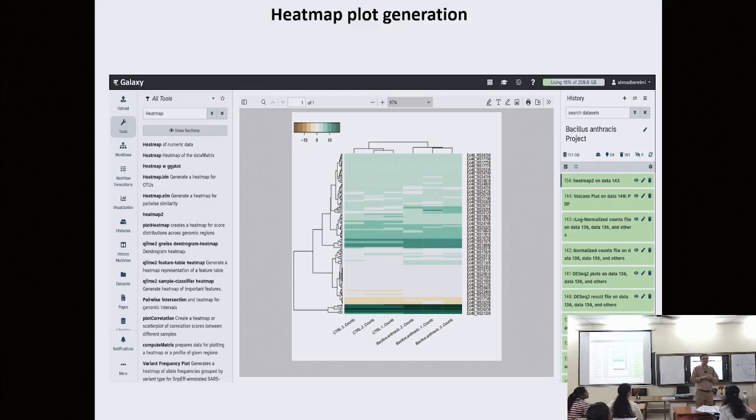Okay. So you will make a gene network, and then you will decompose the network into groups of genes or modules of genes, and those modules could be representing a single pathway or many pathways that are cross-talking. Okay, they may be represented in those modules. And because genes in those modules are connected under many different conditions, it means that these genes are regulated under so many different conditions. So it is not specific to one stress.